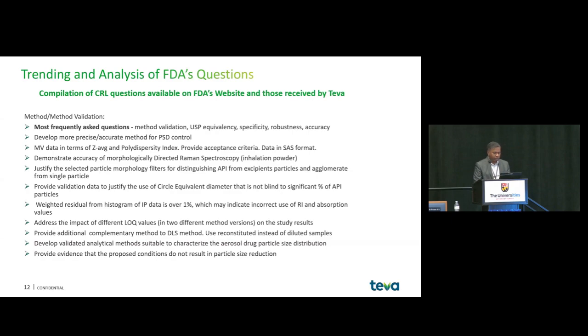Provide additional complementary methods to DLS. Use reconstituted instead of diluted samples. Develop validated analytical methods suitable to characterize the aerosol drug particle size distribution, and provide evidence that the proposed conditions do not result in particle size reduction.